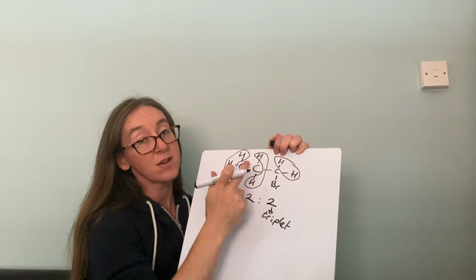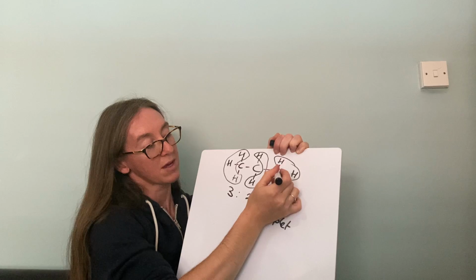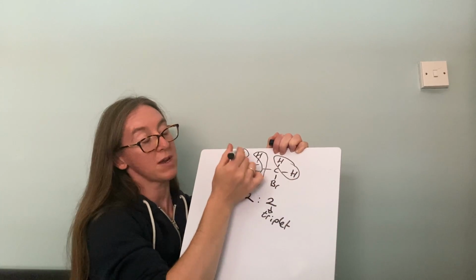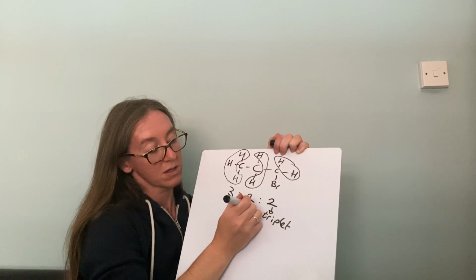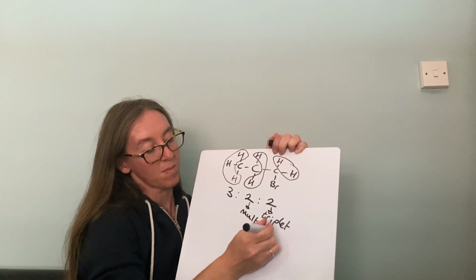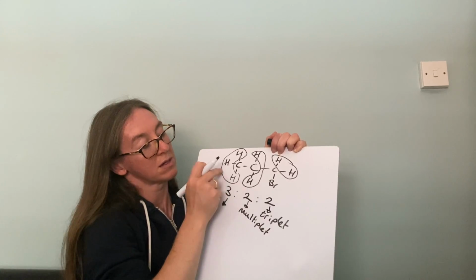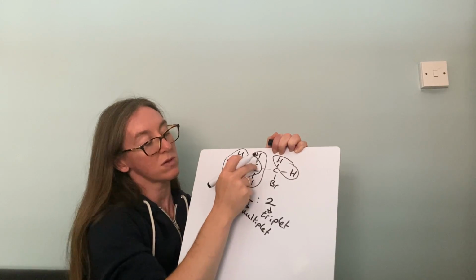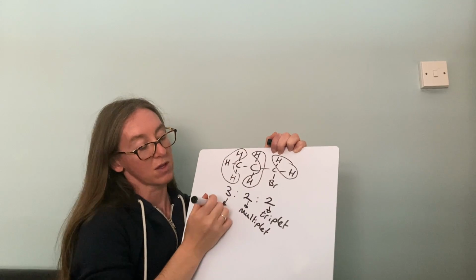These ones, I need to look on both sides. So this side, my carbon's got 2 hydrogens, and this side, my carbon has got 3 hydrogens. So in total, there are 5 hydrogens next door. So therefore, it would split into 6, but I can kind of cop out and just say that would be a multiplet. Here, I've got 3 hydrogens, which are next door to a CH2. So I would say they're coupled to a CH2.